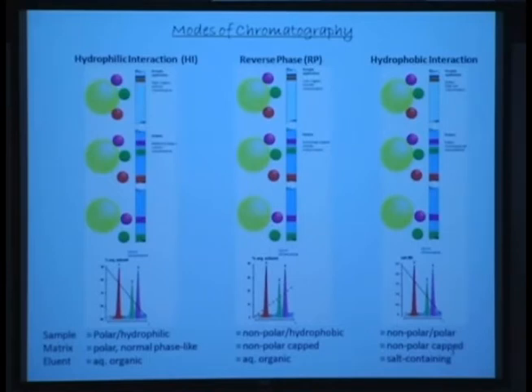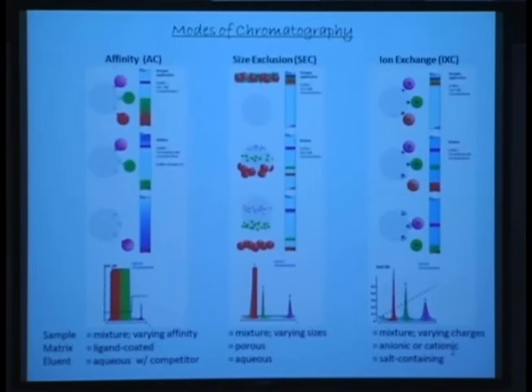And obviously, there is a technique, hydrophobic interaction, primarily based on hydrophobic groups. This technique can be utilized for sugars, but has not really been utilized for sugars. The idea here is that you might have certain hydrophobic groups in sugars. For example, when we introduce labels that are hydrophobic on sugars to help detection, and I'm going to show you an example, we can have those groups bind to the matrix.